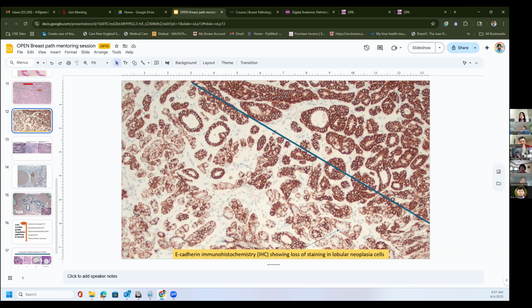Same thing happens sometimes in your training. You may do a frozen section. When you're doing a frozen section, you are freezing the tissue, and that leaves an artifact. Because once you freeze a tissue, you cut a section, you're going to thaw it and then fix it in formalin.